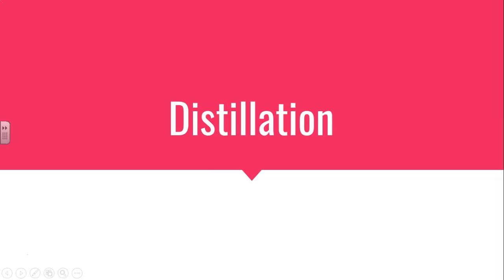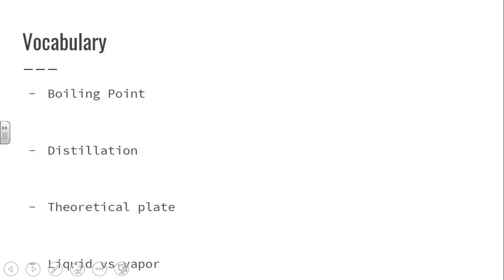Hey everybody, this is your lesson on distillation, and this is for Lab 1 at RCBC, the Simple Distillation Lab. So let's get started. You'll notice here that before we get into some of the nitty-gritty, we're going to need to do some definitions. So let's define all of these things so that we know what the heck is going on.